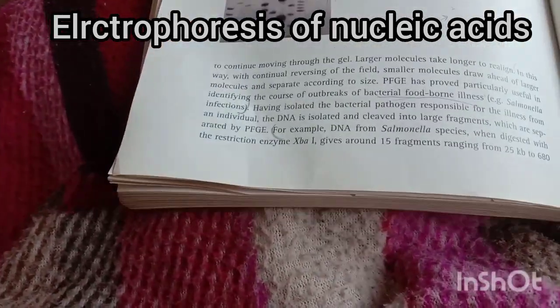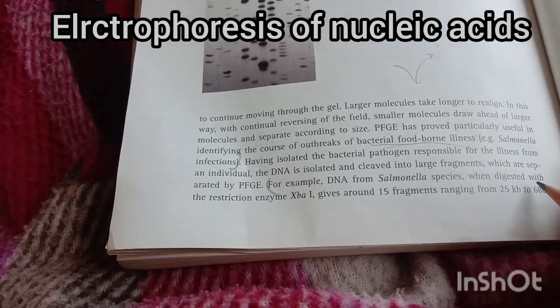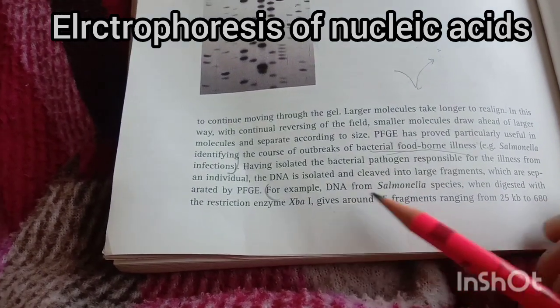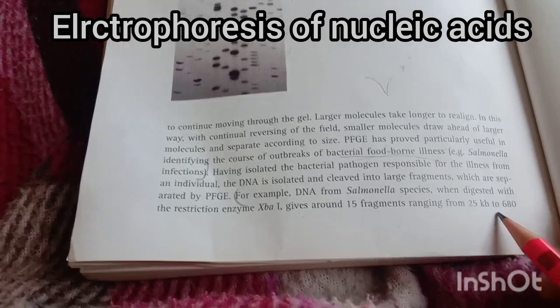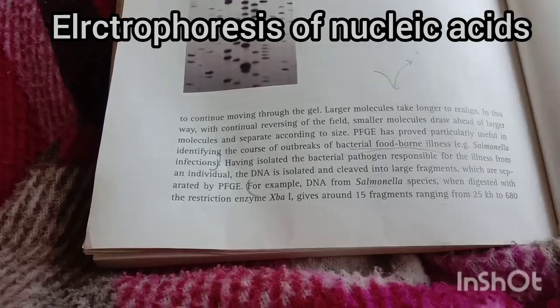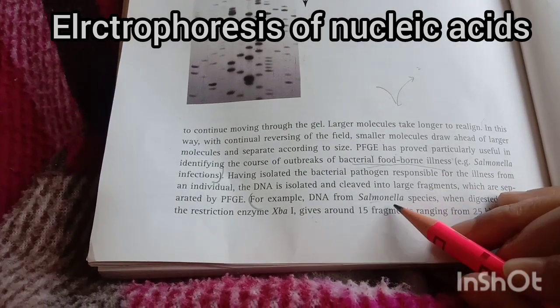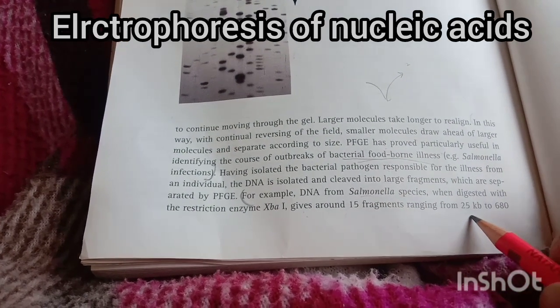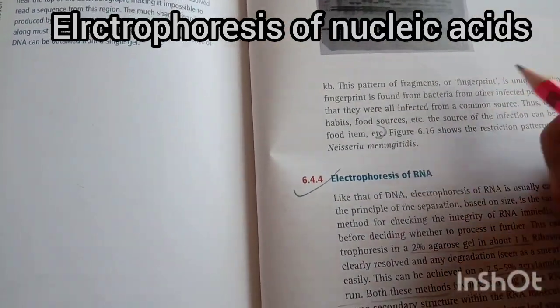Next we have an example. Salmonella species, when digested with the restriction enzyme XbaI, give around 15 fragments ranging from 25 kb to 680 kb. We all know that Salmonella causes typhoid, which is caused by contaminated water and food consumption. So we are analyzing here Salmonella typhi, which has 15 fragments with sizes from 25 kb to 680 kb.